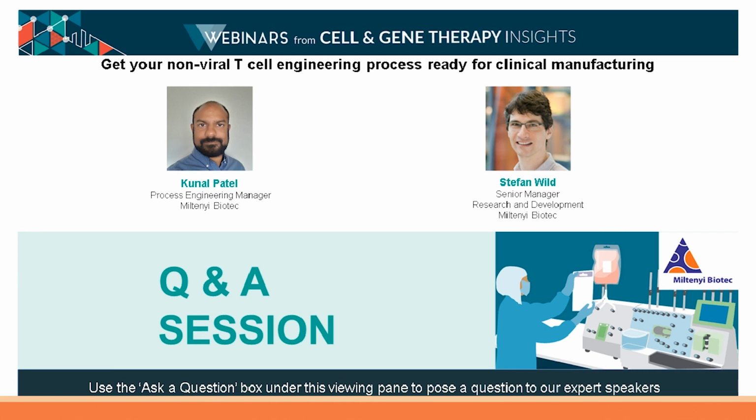Yeah, that's a very good question, because of course this also has to be done automatically. And for me, mixing has two aspects. The first is the mixing ratio, which needs to be accurate so that you really deliver the same amount of nucleic acid to the cells. And of course, the mixing also has to be done homogeneously. We have included a microfluidic device in our electroporation cuvette, which covers both questions. We have two microfluidic channels which define the mixing ratio of the nucleic acid to the cells. So this is accurately done because it's basically fixed by these microfluidic channels.